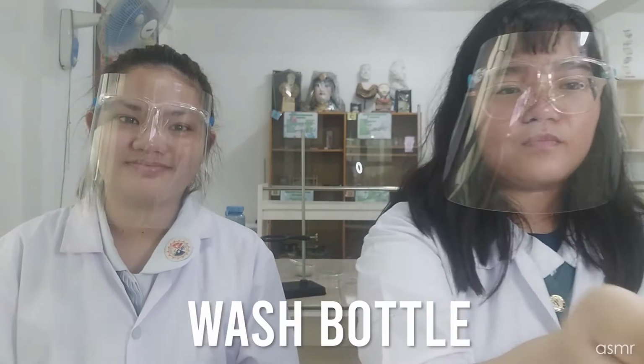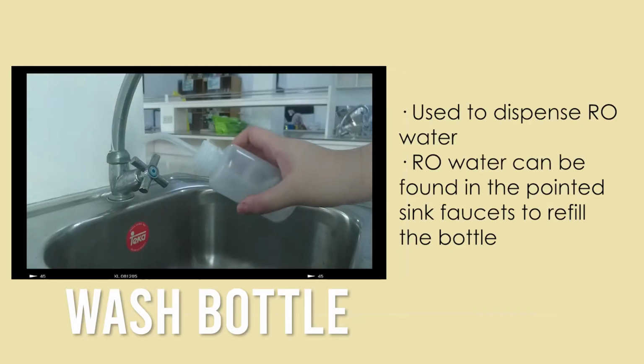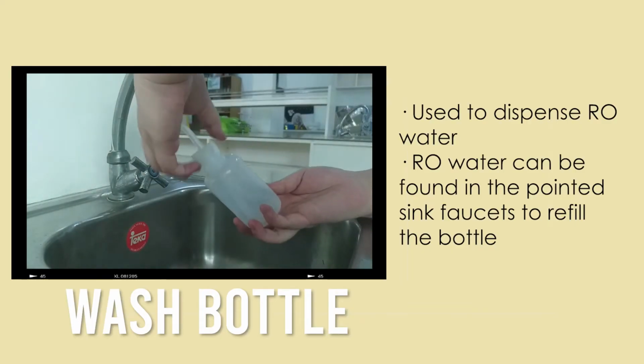Another thing that is notable and really useful in the laboratory is the wash bottle. Wash bottle is used to dispense RO water.